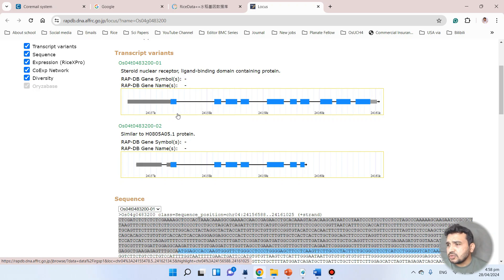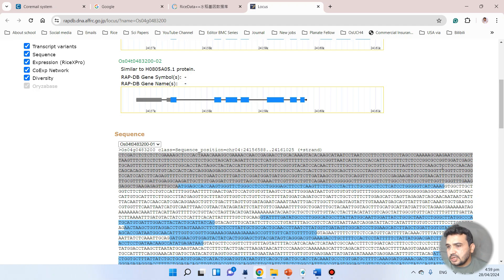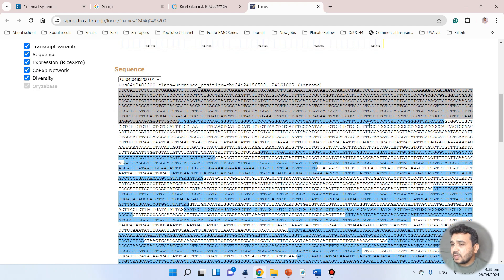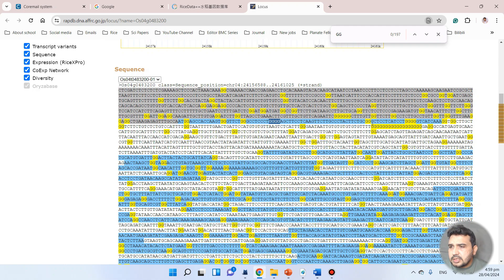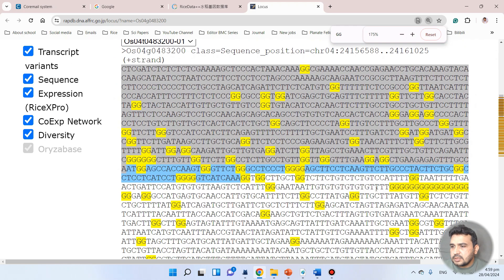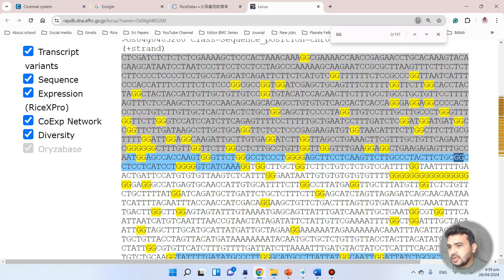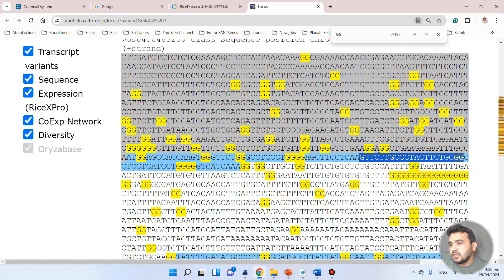In most studies, people choose only the first or second exon. In this example we will choose the first exon. We can simply copy the sequence of the first exon. If you want to find the PAM sequence in the first exon, use Ctrl+F and write double G. Here we have double G, but we cannot take this one because upstream there are only two nucleotides. There are also tetra-G occurrences we cannot use, but this GG followed by C looks good to take as a PAM sequence.